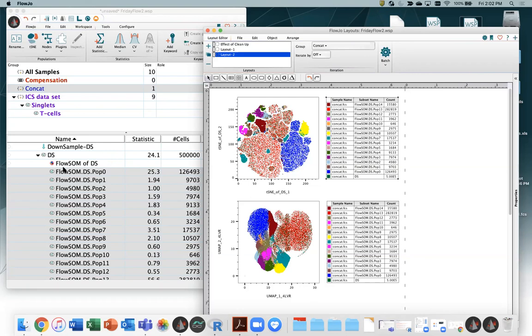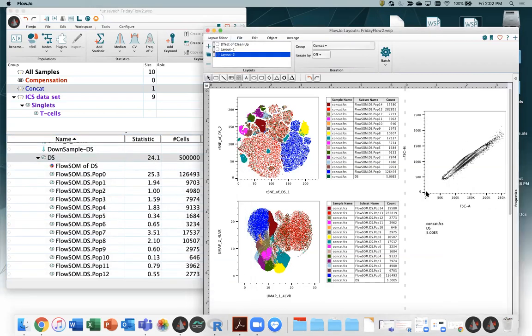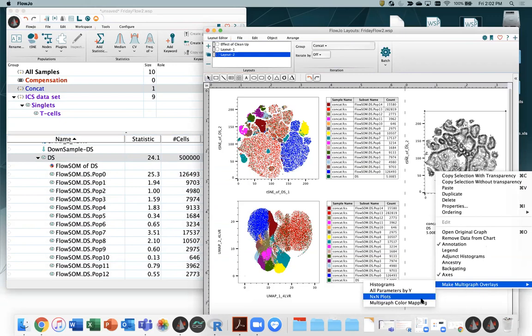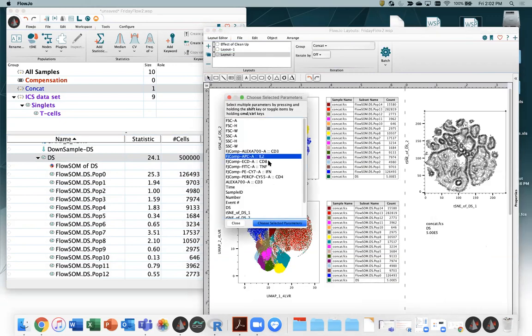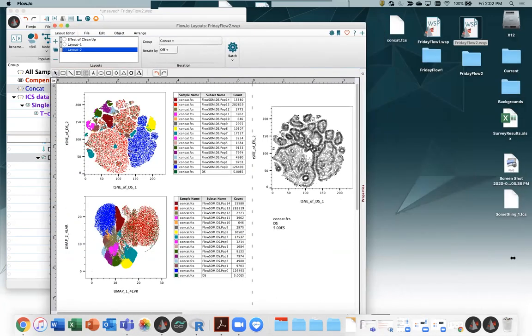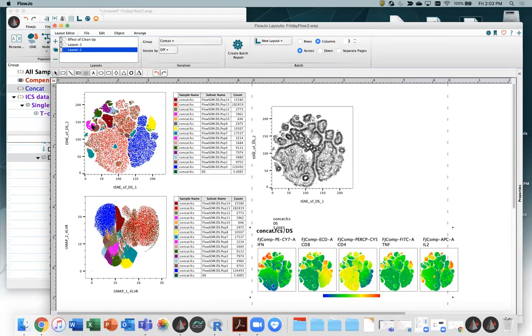We could, if we wanted, also as a map, just bring in one of these again, and we could heat map by parameters to get a feel for what's where. Again, knowing that things up here tend to be the more interesting, smaller populations that are expressing a variety of the functional markers, 4s, 8s. We could have done the same thing with the UMAP representation of this, but we can see, because I've kept the colors consistent, that these populations are tending to be in here.